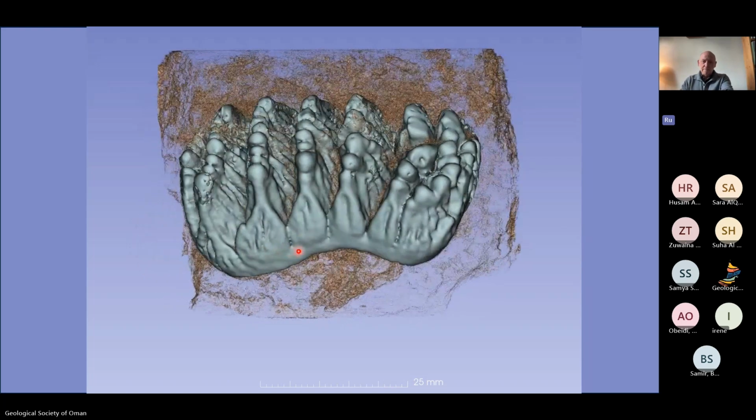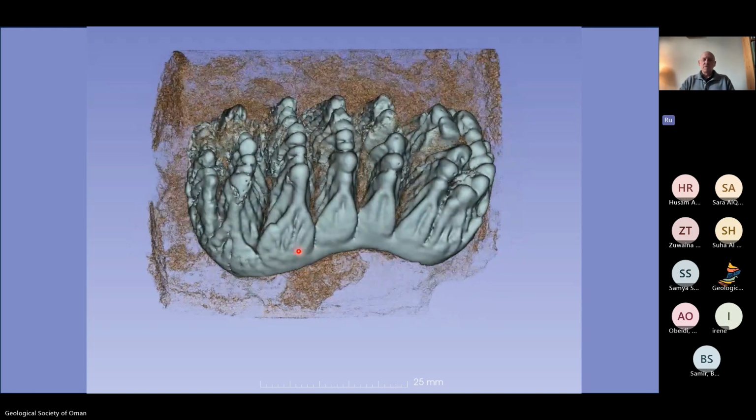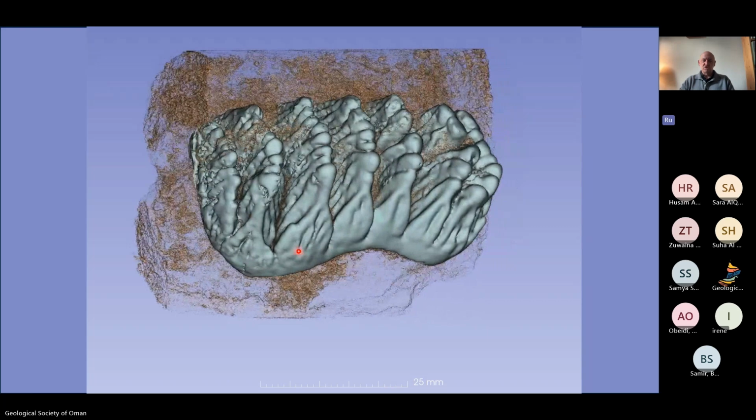It's a milk tooth, but it completely transformed the perception of the shape and the components of this tooth. A student had interpreted it basically entirely incorrectly, but now I could print out 3D models at the proper scale, and that is now accepted for publication.